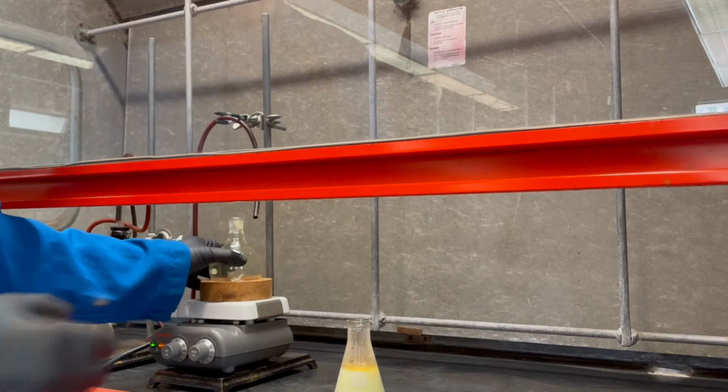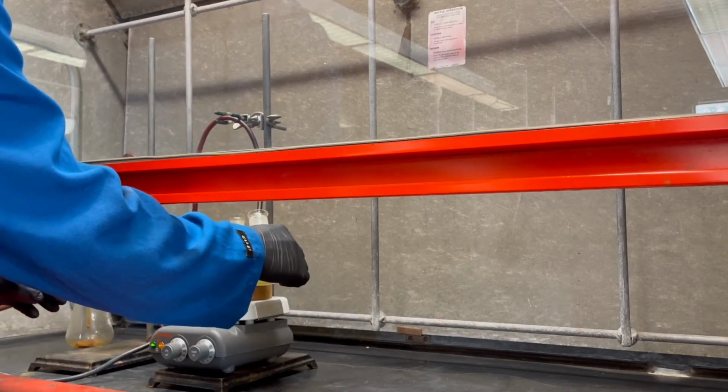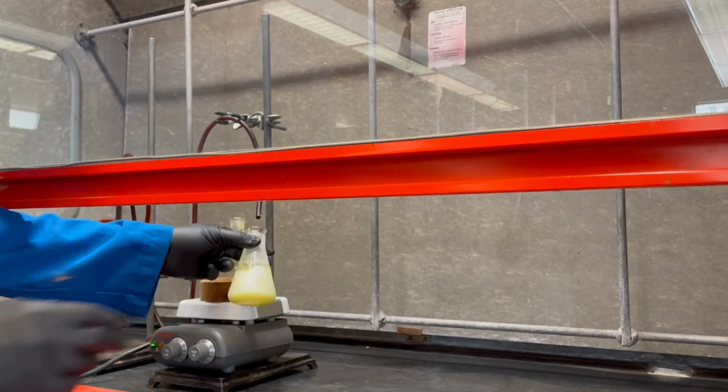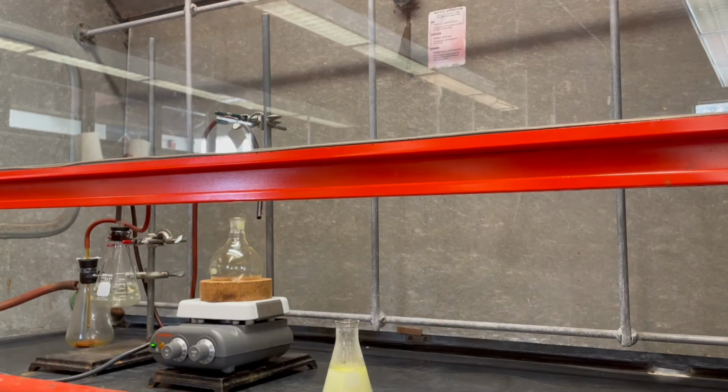Okay. Let me get this real quick with it. Sorry, you can't see it, but you know what I'm doing. Get it with a stir bar.